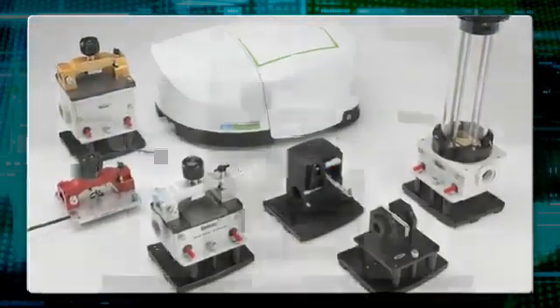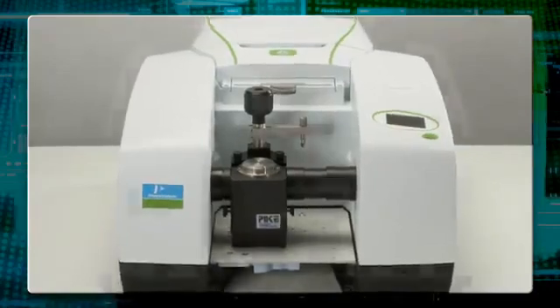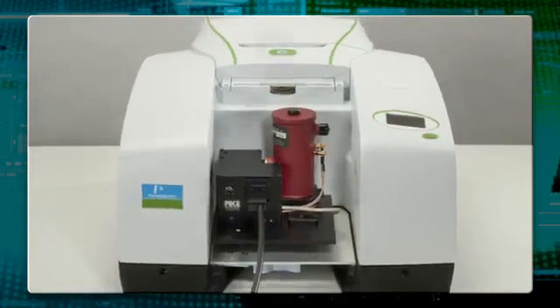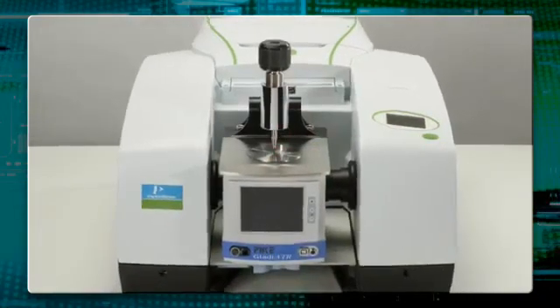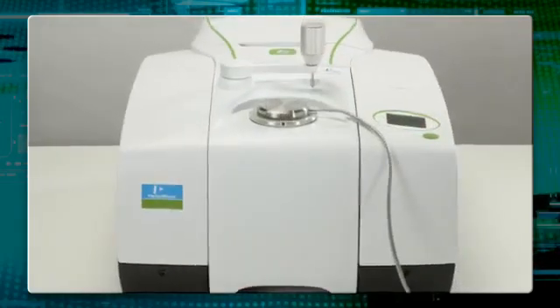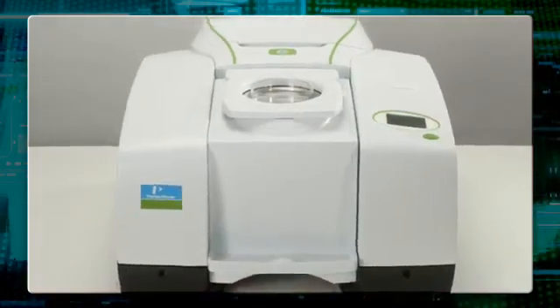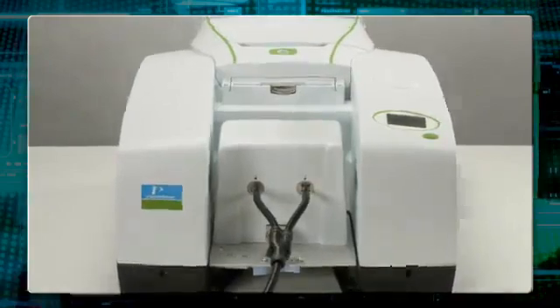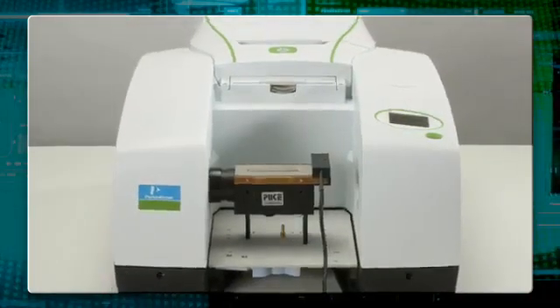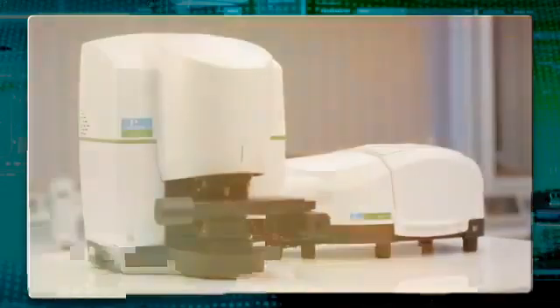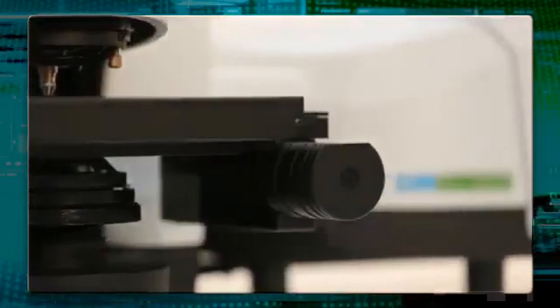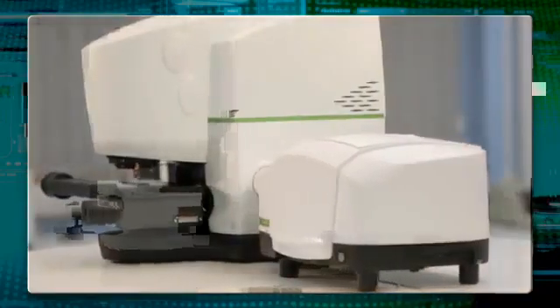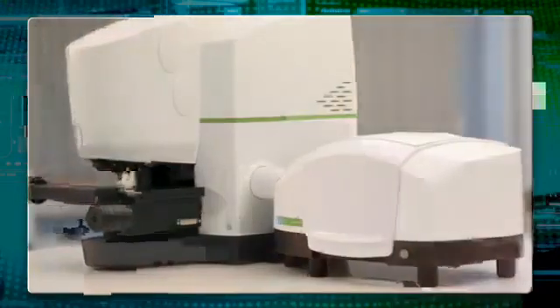With the Spotlight system, the macro IR sample area comes as standard, providing the highest performance and versatility for larger or standard IR samples, enabling you to get more from your system. Coupling Spotlight with Spectrum 2 enables you to perform fast, accurate mid-IR analysis and assures the quality of your materials across a wide range of applications, combining performance and low-maintenance design.